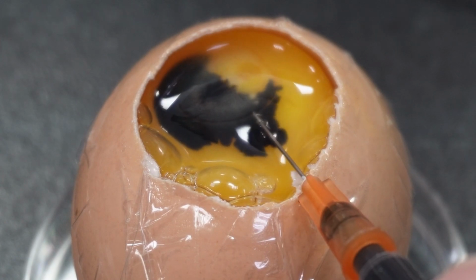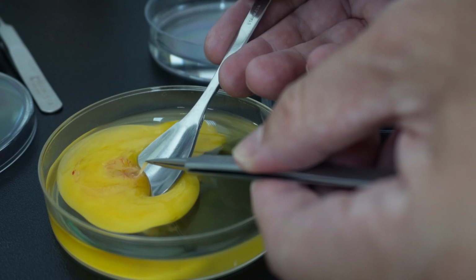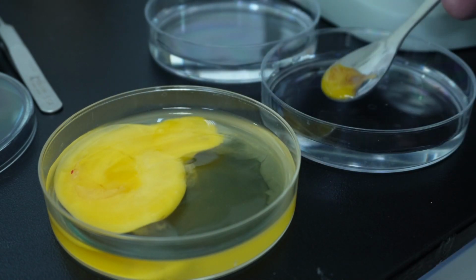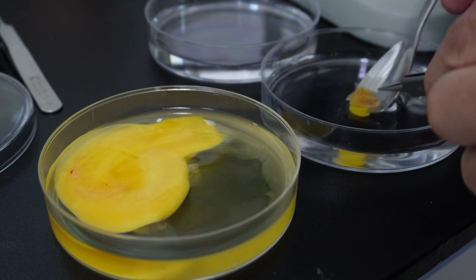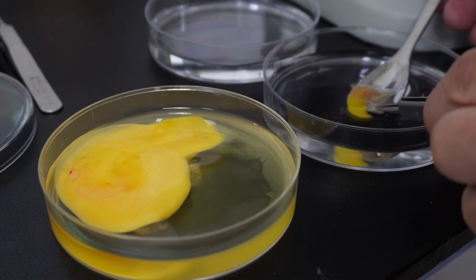Simple, but effective. And then actually lifting the embryo out. Does that depend on its size or stage? It really does, yeah. If it's a bit larger, more robust, you might be able to gently scoop it out with a small spoon, then transfer it to a dish of PBS, that's phosphate buffered saline, just a holding solution. Okay, but the smaller ones.